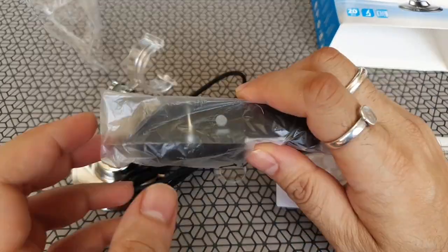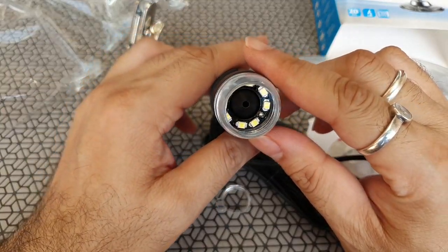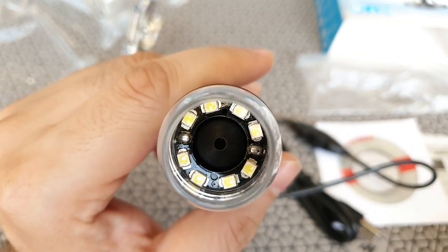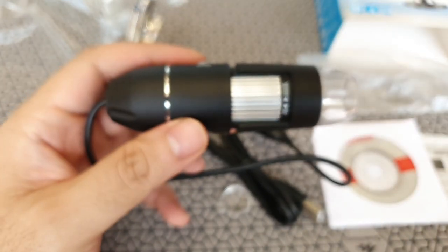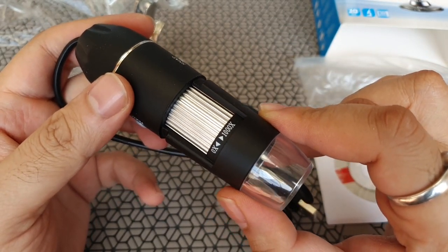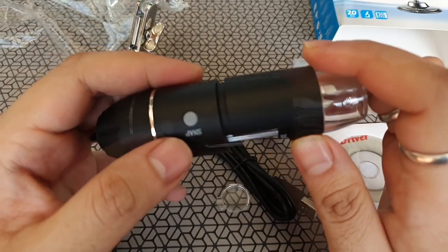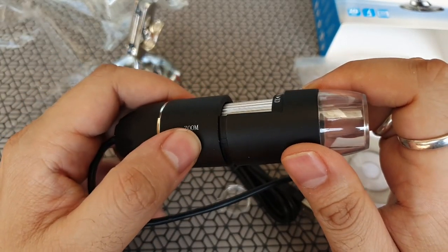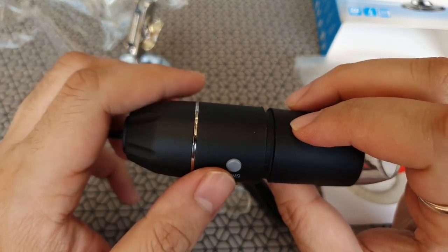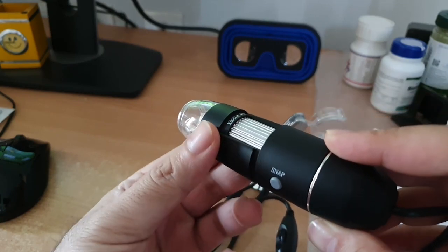The main device is built well — good quality plastic. In the front you can see it doesn't have any glass lens; it directly shows you the 8 LEDs and there's a small tiny hole which I think is the CMOS sensor directly inside. There's an adjusting knob on the side for focus or zoom, giving you up to 1000x magnification. There's a snap button on one side and a zoom button for digital zoom up to 6x, and you can click snaps of whatever you're seeing. There's also a small notch where the stand clips in.